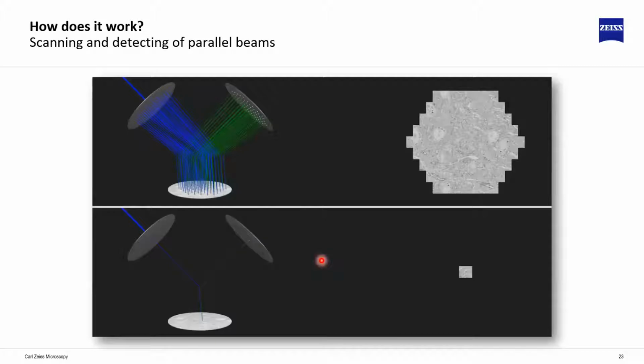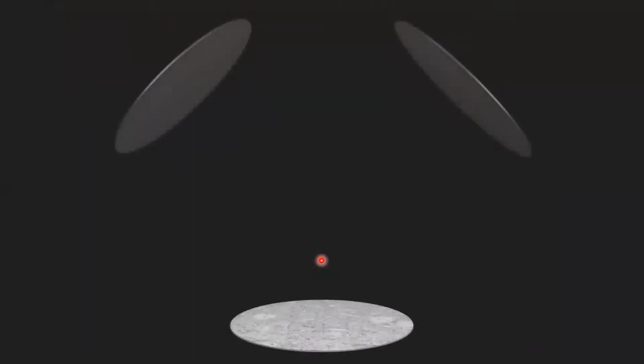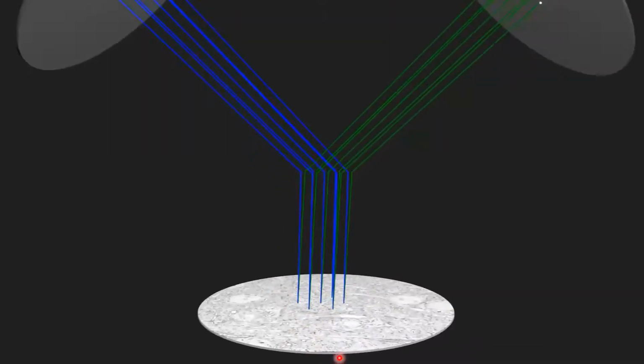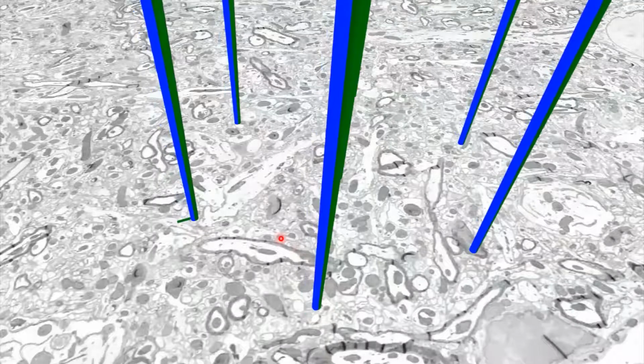All of that is, I think, best understood with this small animation, where we're comparing a single beam machine with a multi-beam scanning electron microscope. Here's our beam splitter that allows us to separate that beam into many beams. In this case it's 8, I think, if I'm not mistaken. No, it's actually 7. Those are scanning over the surface, and each of those interactions at the surface creates a signal stream, in green, that gets projected onto our detector.